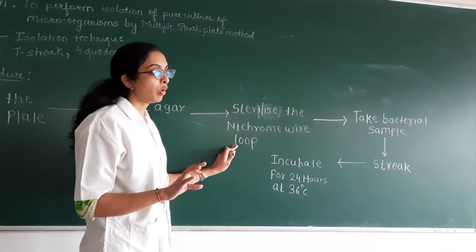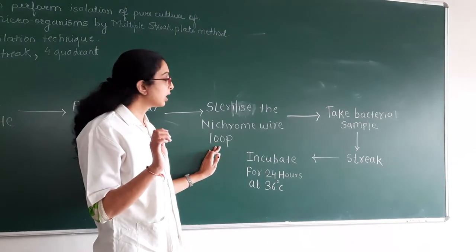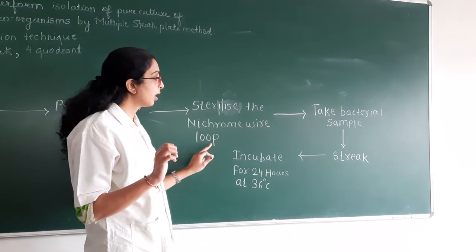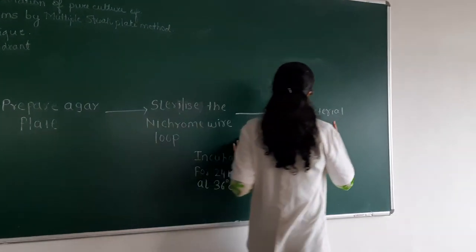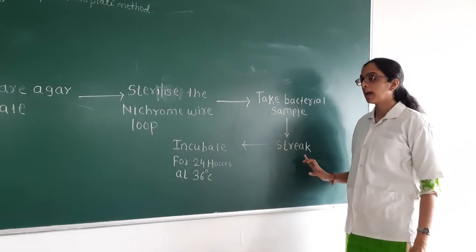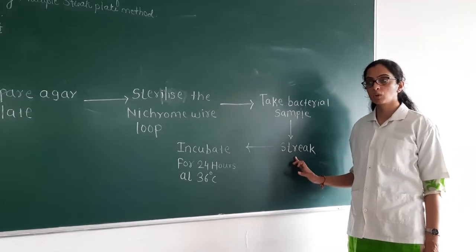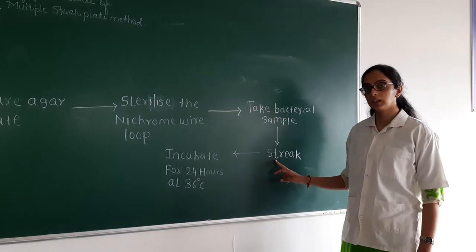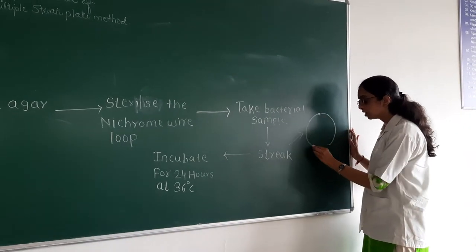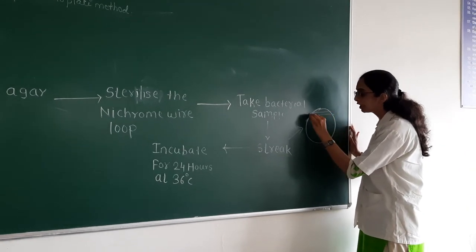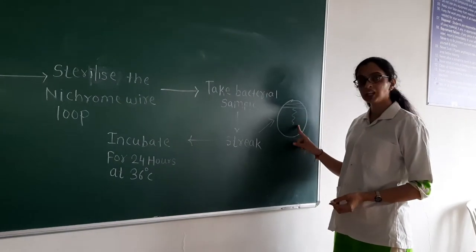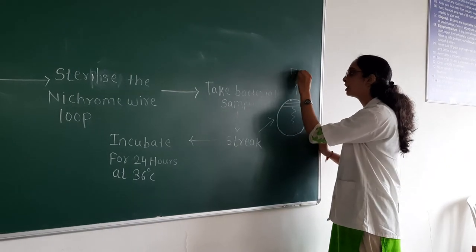Then you have to perform the inoculation procedure. First, sterilize the nichrome wire loop, then take the bacterial sample and streak it as per the marking on the plate. Two types of streaking are used: the T-streak, which is done in the form of a T shape, so you mark it likewise on the petri plate before adding the agar. This type of streaking is known as the T-streak technique.